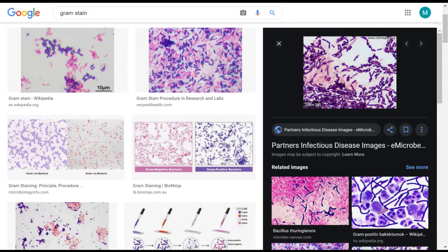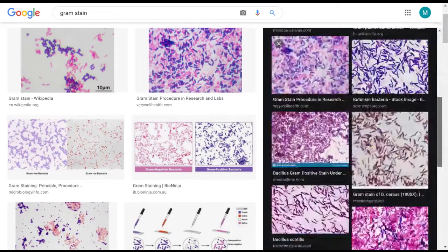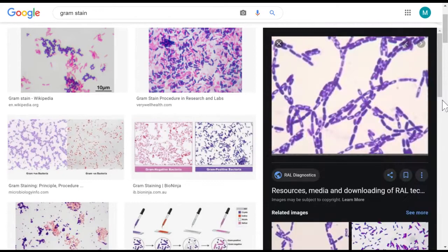Just give me just a second. I'm doing something here. Okay, I'm just looking at something, see if I can find any more. Okay, give me just a second. Oh, this is a good one too. Let's take a look at this one. This one is important, though probably not going to see this one in the test, and there's another good one next that I'm going to show you. However, this is an important one in the sense that this is the top Gram stain Wikipedia one. What would those arrangements be? Okay, give me just a second. I'll take a look at that one in just a second.